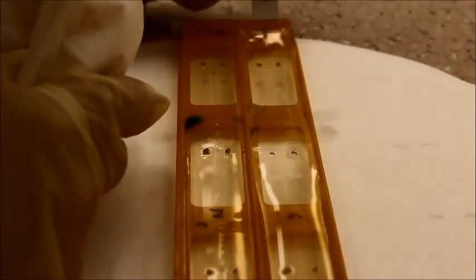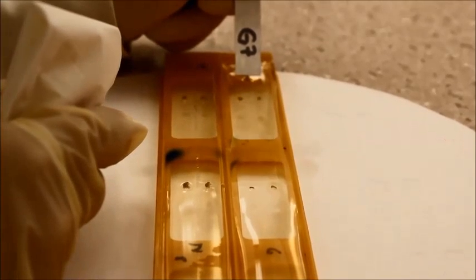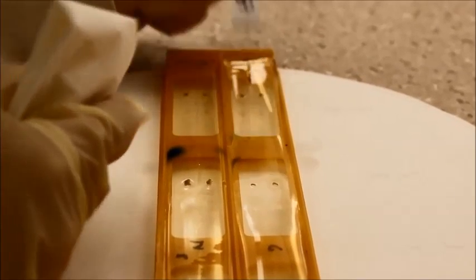Once electrophoresis has been completed, remove the frame from the tank. Make cuts at both ends and remove any glass strips from them using a gel knife.